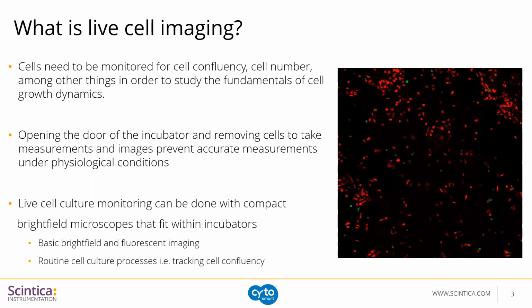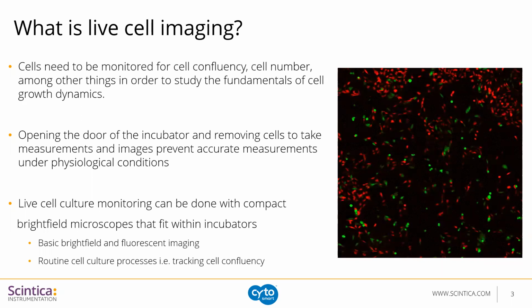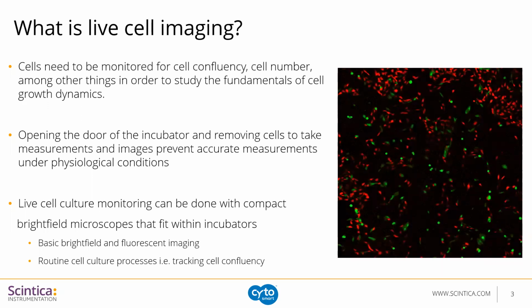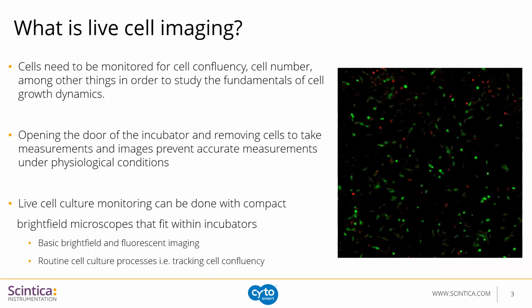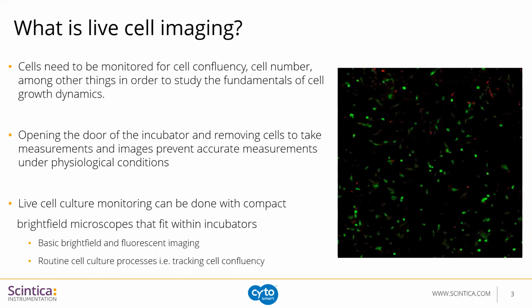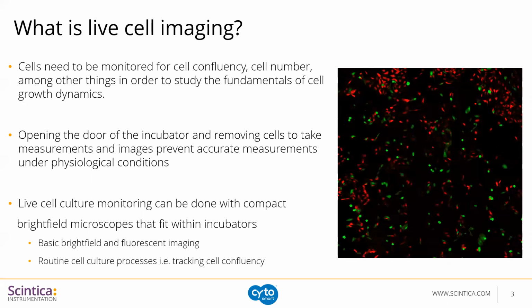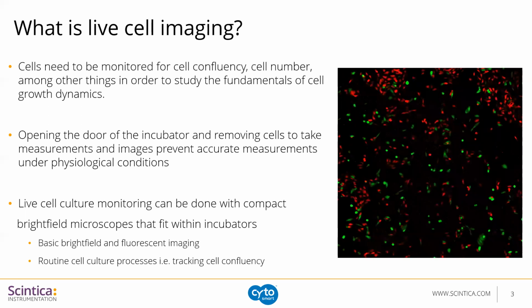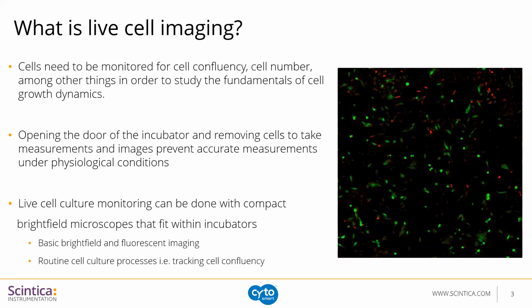What this means is that most scientists never actually measure cells under physiological conditions, and the cells they're looking at are generally in some state of shock. As a result, in recent years, live cell imaging has become really a desired and often necessary tool in many laboratories to more accurately monitor and measure cell dynamics under the appropriate environmental conditions.